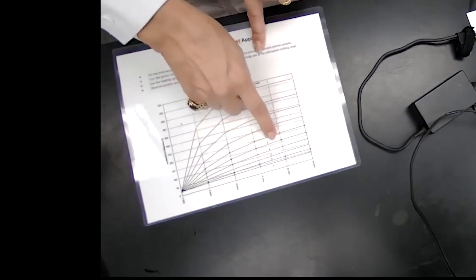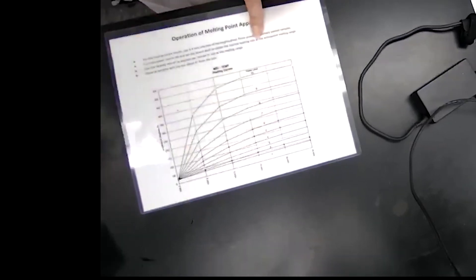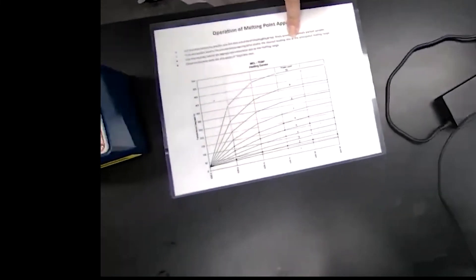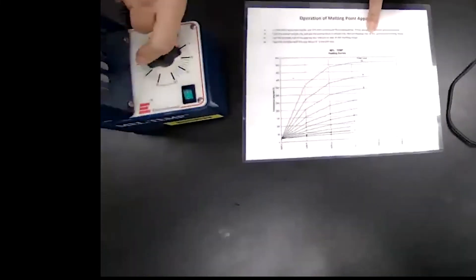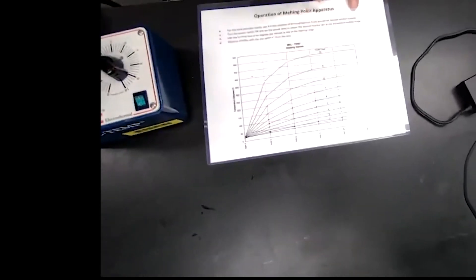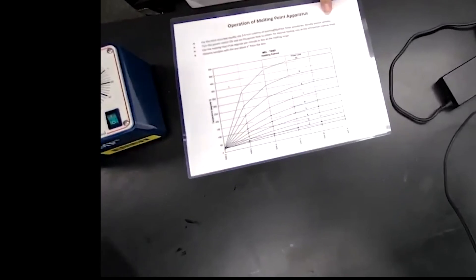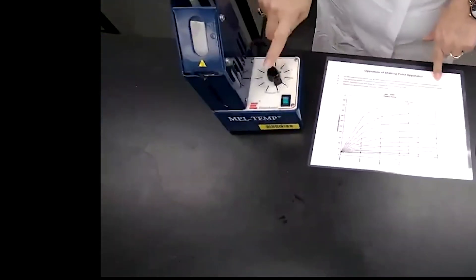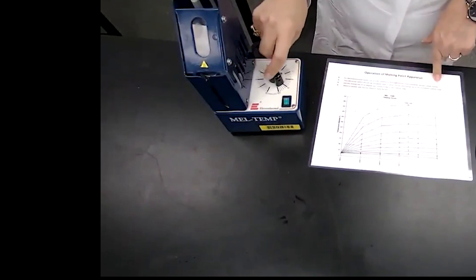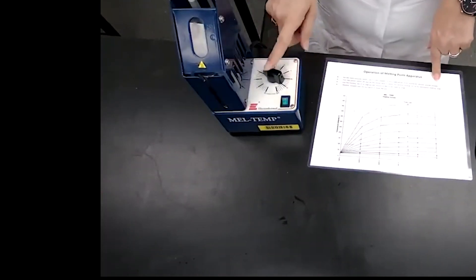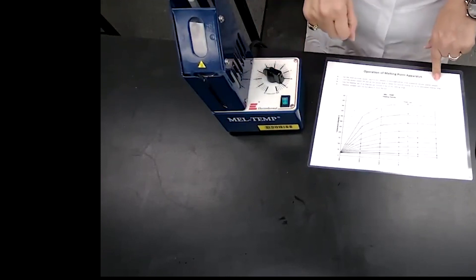With that plateau, we know that the last part of the melting process — the heating of the sample — is going to be slow, and that's what we want. By setting the power regulator at the proper degree, we are going to manage the increase in temperature. Of course, if you see the change in temperature is much faster than expected, you can always adjust it by lowering the degree on the power regulator.